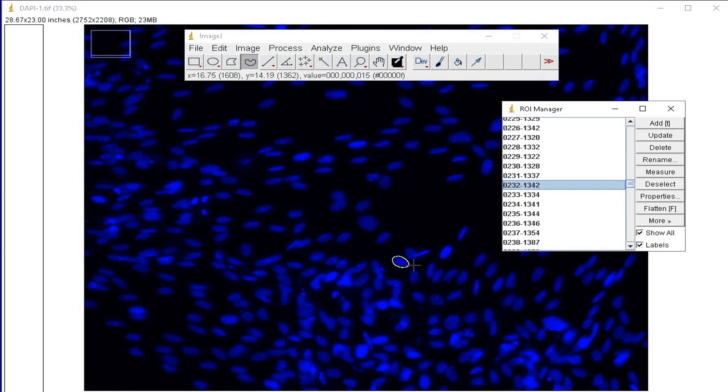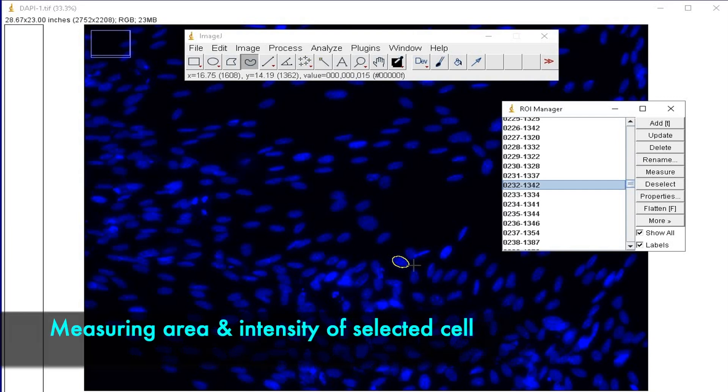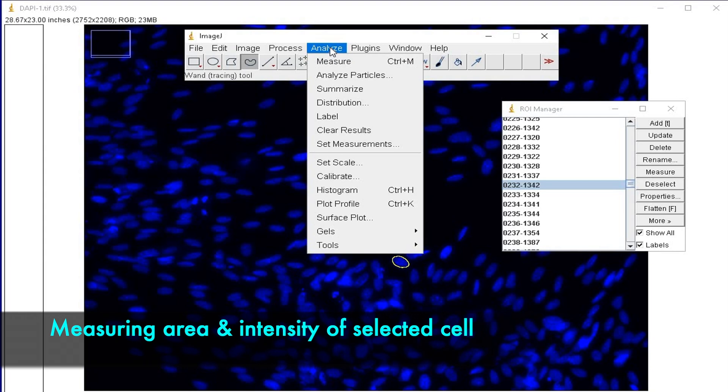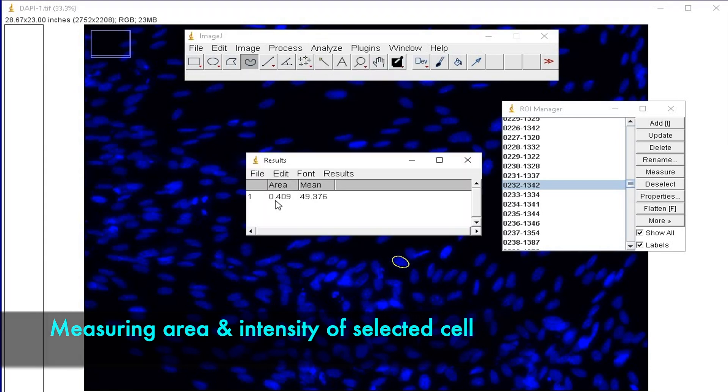To measure the area and the mean intensity of the selected cells, click on Analyze and Measure.